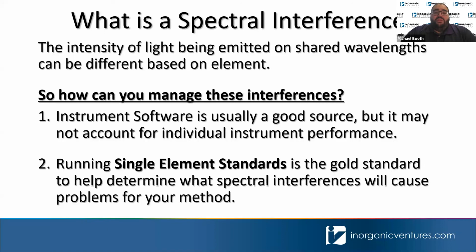So really the gold standard is running single element standards. Just like we did with the last example, we spiked in zinc on top of it. We could have run zinc as a single just to see as well. But the single element standards are really the gold standard.